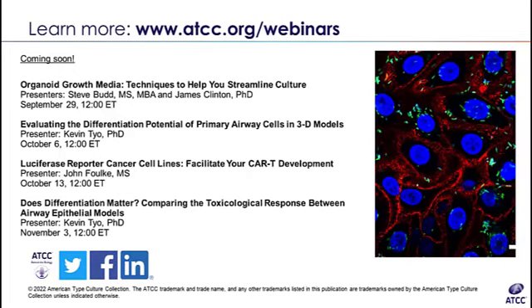Okay, so this next question, I'm going to ask you to elaborate, Mike, a little bit on an answer that you gave about cells detaching. Could you elaborate on CO2 versus bicarbonate for use for buffering? Okay, so CO2 and bicarbonate work together to create the buffer in the culture media.